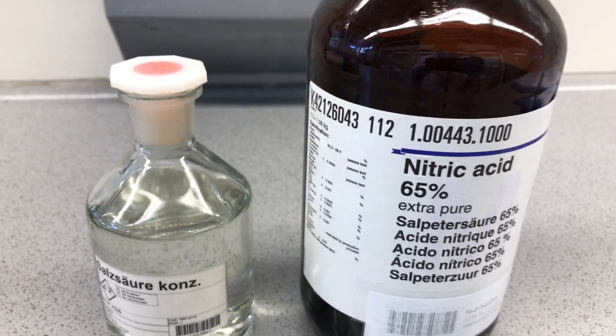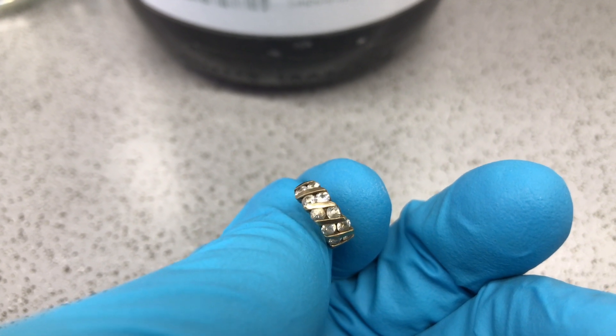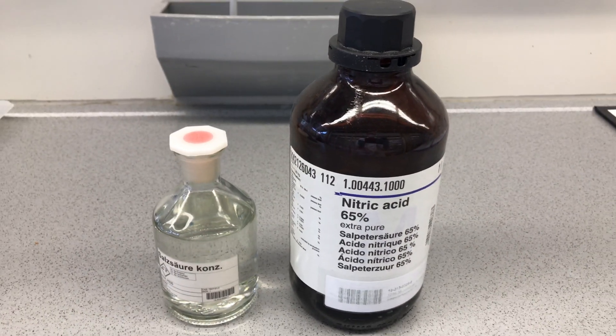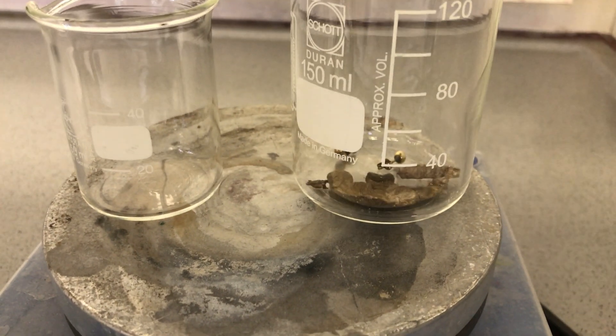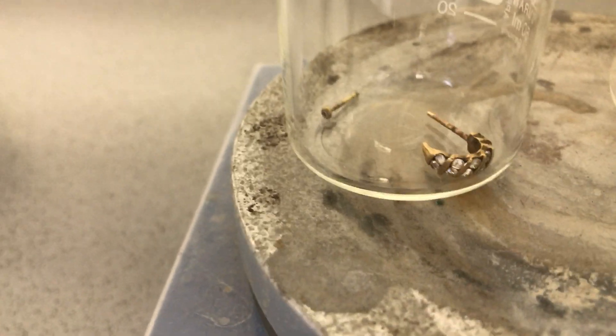To dissolve this stuff we are going to use a mix of nitric and hydrochloric acid. I also have this gold earring with diamonds, and we are going to dissolve the gold in another beaker. When hydrochloric and nitric acid are mixed, it makes something called aqua regia. This stuff can dissolve gold, and it can even dissolve platinum.